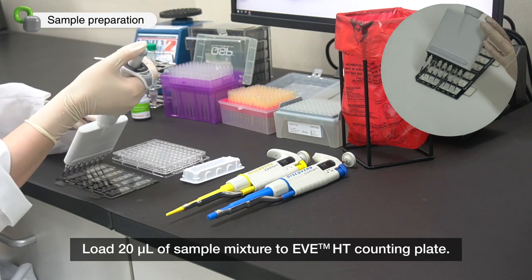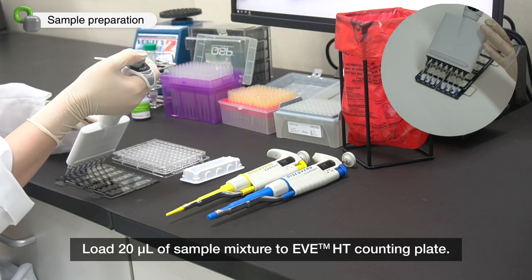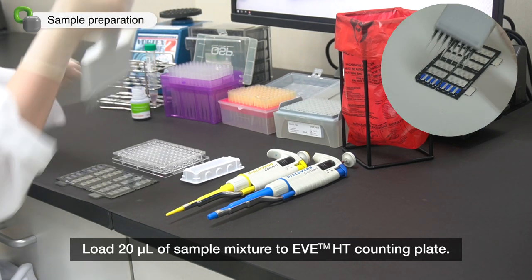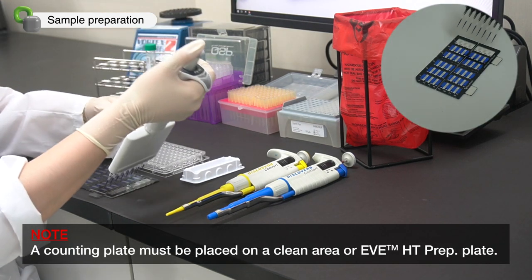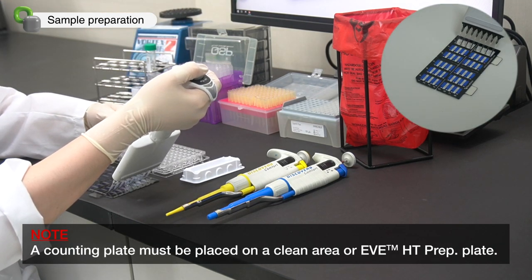Load 20 microliter of sample mixture to EVE-HT counting plate. A counting plate must be placed on a clean area or EVE-HT prep plate.